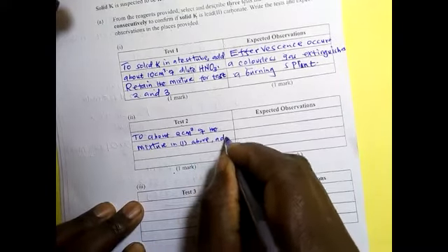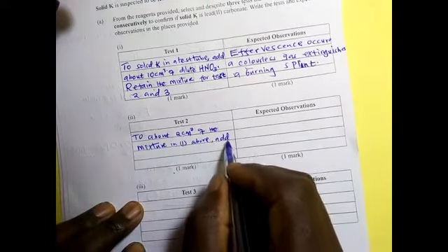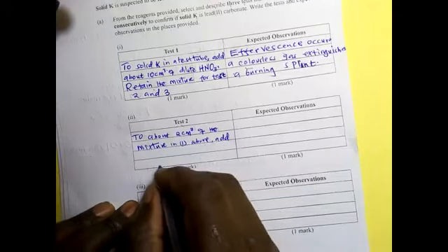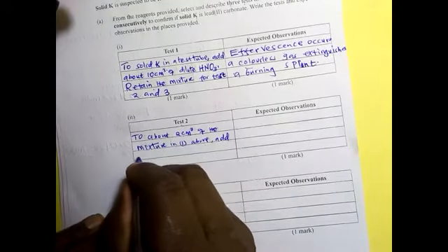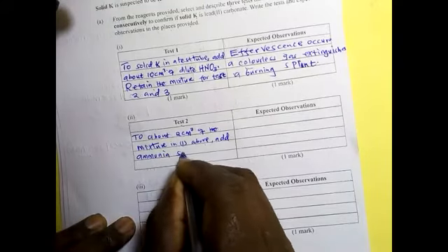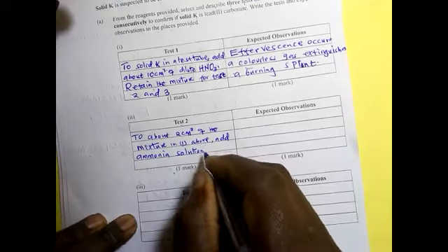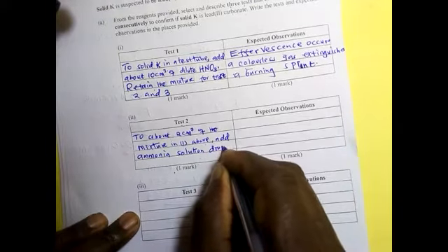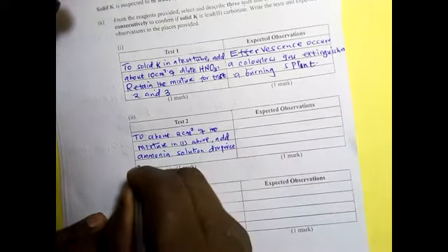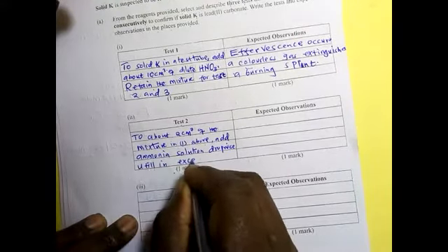Add aqueous ammonia solution dropwise until in excess.